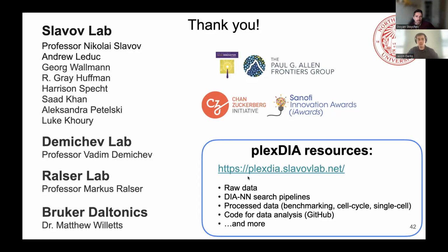Absolutely. And there's somebody in our lab, Georg Wallmann, who is making software that you can sort of plug and play and look at your DIA data and then optimize based on some reports that he's using the software to generate. So look forward to that.